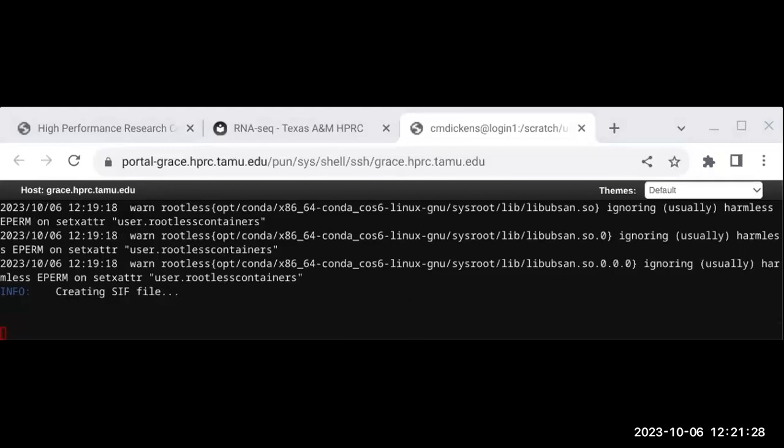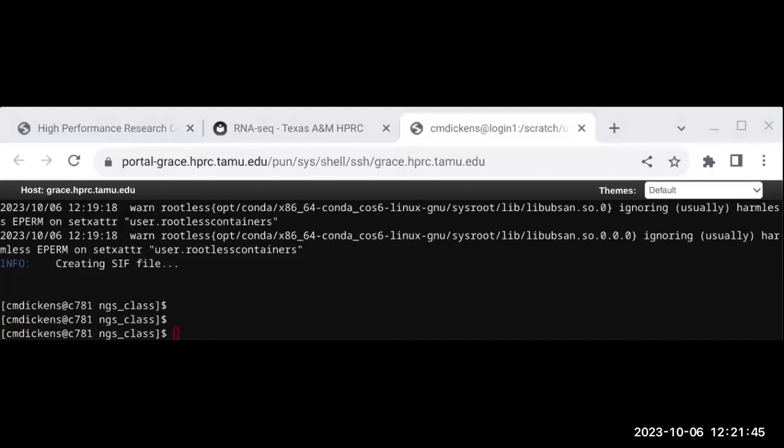Okay, so just enter that in. Has anyone entered blastp -h and you see the help for blastp? Yeah. So you can also do, I think, blastn -h. So it probably has all the blasts in there, blastn, all those blasts in there.